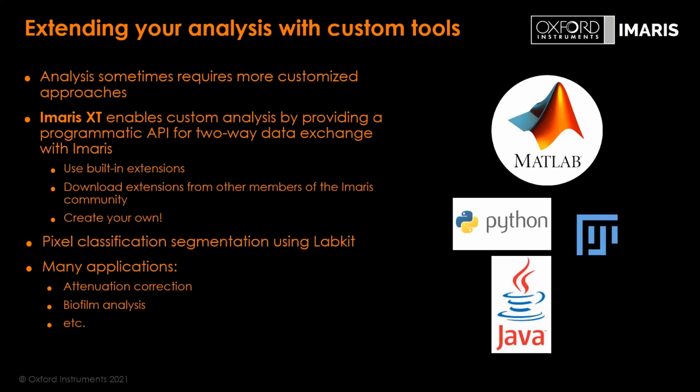And then there's a second button where you can go into Vantage, which is our plotting tool in IMARIS itself, where you can compare all of those images in one plot in IMARIS itself. So those two options are available. And I can show this in the software itself, where it's located as well.